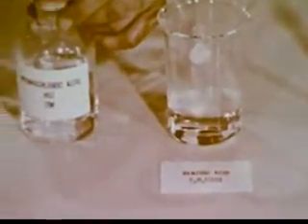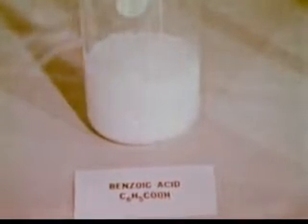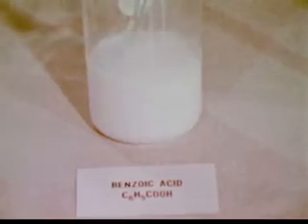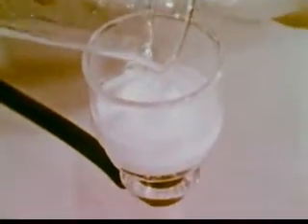We will now acidify the basic solution. Addition of a strong acid causes precipitation of the benzoic acid. Measurement of the acid added shows all the original hydroxide ion remained after the reaction. Hydroxide ion was a catalyst. The benzoic acid is filtered from the solution. We wash the benzoic acid to free it from excess solution.